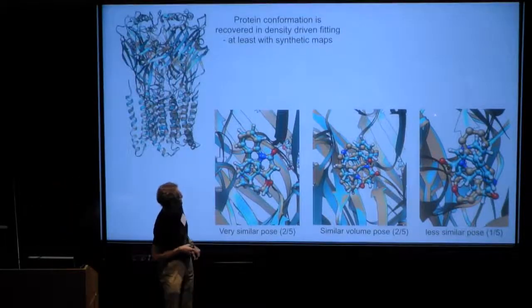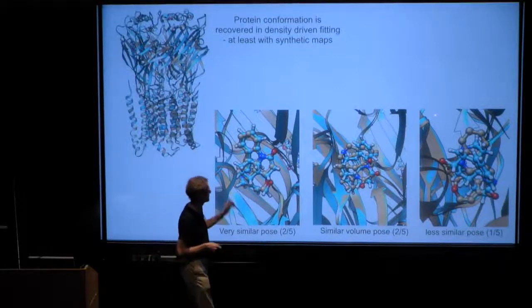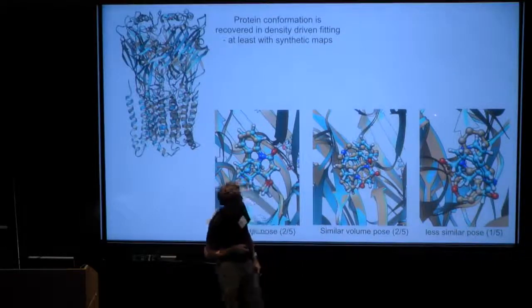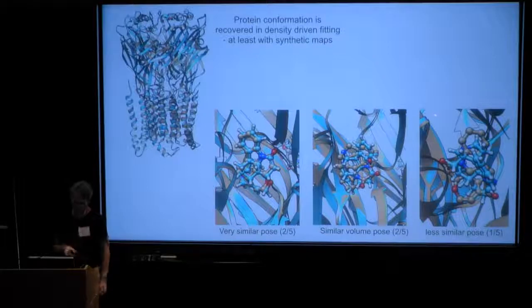That appears to completely reproduce the pose. I was kind of shocked to see that. That might be a coincidence. But we get plenty of poses that are almost exactly the same, and a few that occupy the same volume at least, but I'm not sure about the orientation there. On the other hand, given the initial density, I don't think the experiment was either.